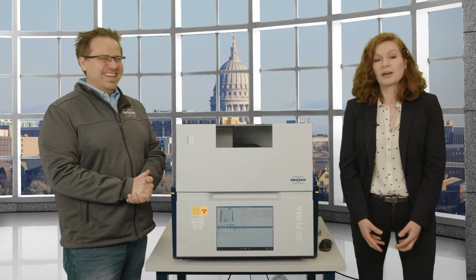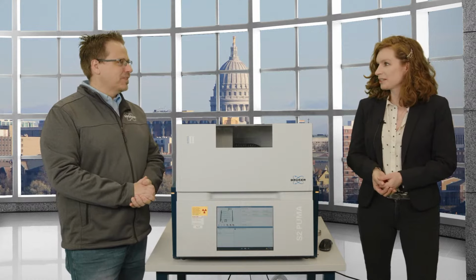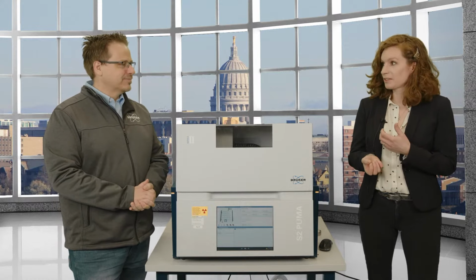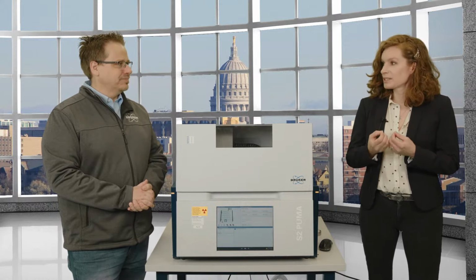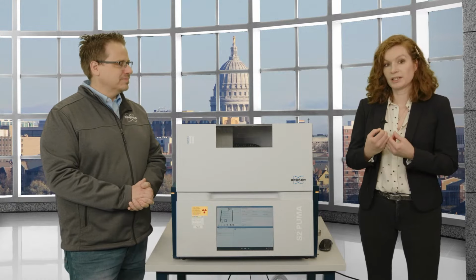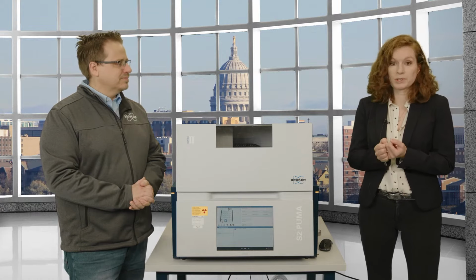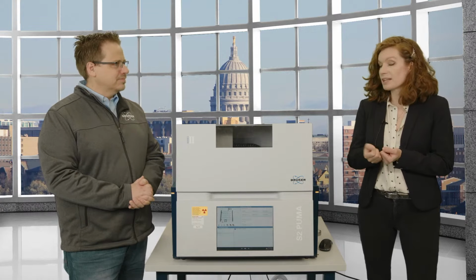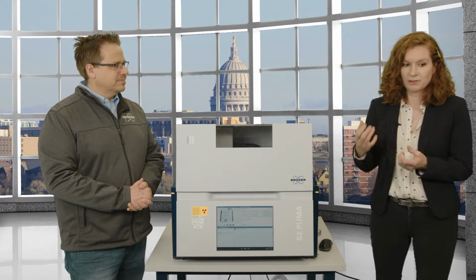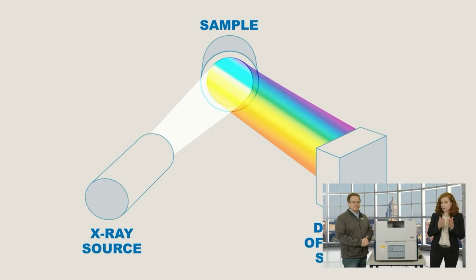It's not my favorite. No, I do like it because it's really cool that you can basically put anything in the machine, and you get a spectrum and you can at least see what's in it. And if you tell the machine enough information, you can either get an educated guess what's in it, or you can get precise down to ppm levels. And I really like in the video how it explained the XRF principle, that there is a source, a sample, and then the rest that happens is in the part of the detection.